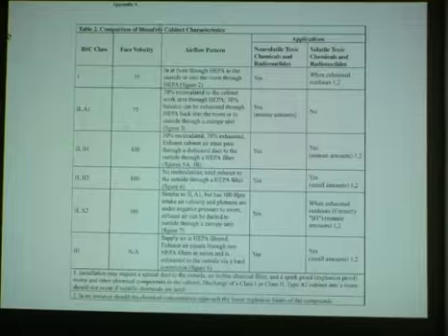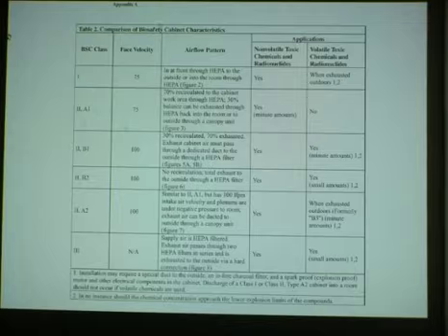For the others, it is 100. As far as the airflow pattern is concerned, in class 1 cabinet, there is no HEPA filter at the supply. The air comes in at the front and is exhausted to the outside or into the room through a HEPA filter, or sometimes, if it is considered not necessary, without a HEPA filter.